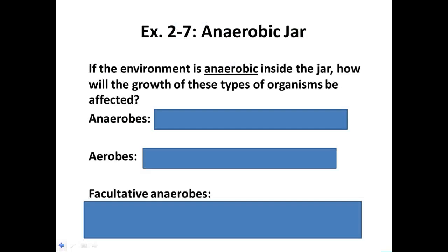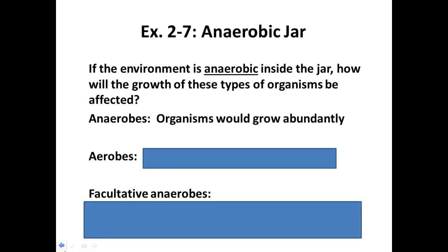So if the environment is anaerobic inside the jar, how will it affect the growth of these organisms? Well, we know anaerobes, right? If we're creating an anaerobic environment, what are we doing for these guys? We're creating the habitat just for them, right? They're going to be happy. They're going to grow abundantly.